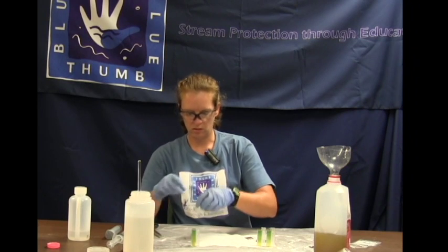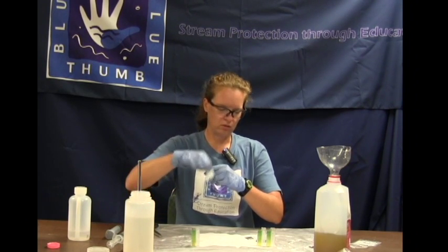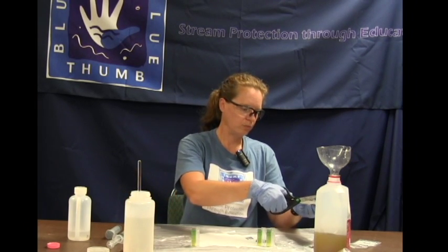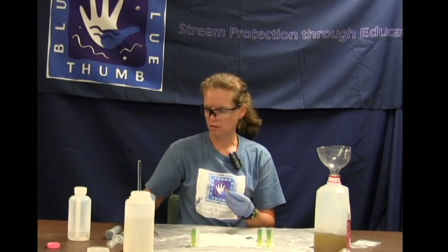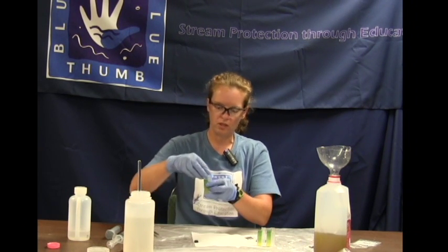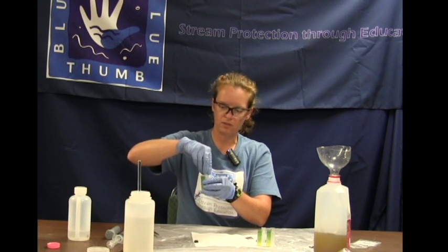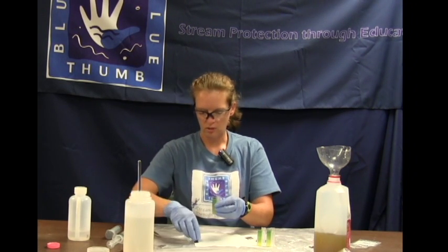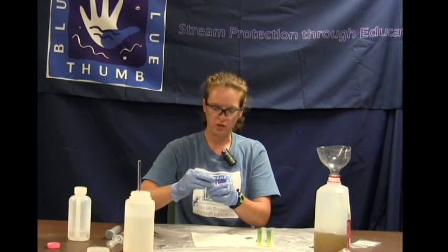And as we've said in some of the other episodes of these videos, the blank is going to be testing the deionized water, making certain we're not getting any sort of false positive readings. It's testing the equipment, it's testing the reagents, it's testing you as the scientist.